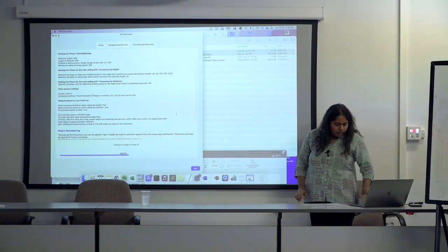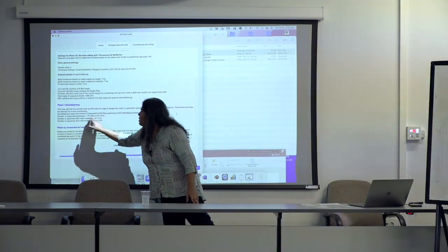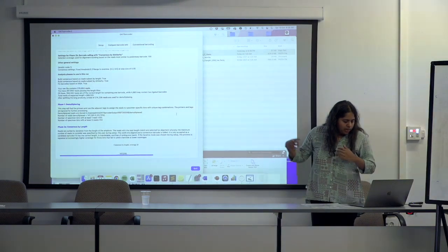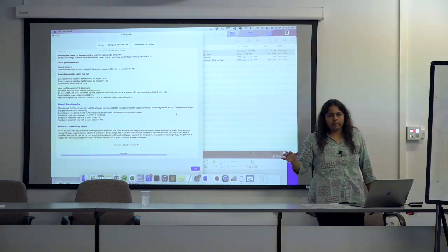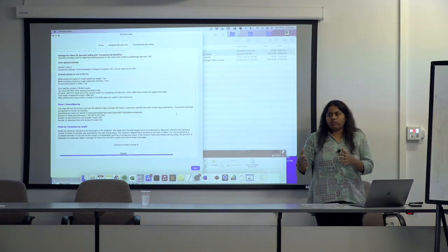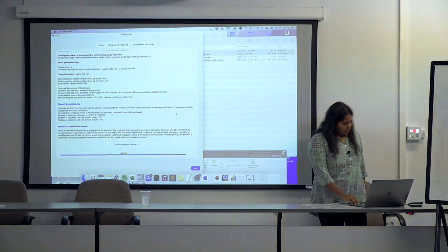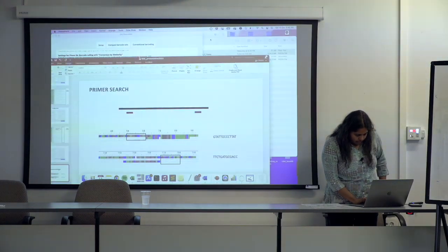Yeah. So what you can see here is your statistics. You have the number of reads. This is the demultiplexing rate. And how many bins have one read, how many have 5. Usually we process everything which has over 5 reads, and later on give you the coverage information for you to decide whether you want to accept them or not.